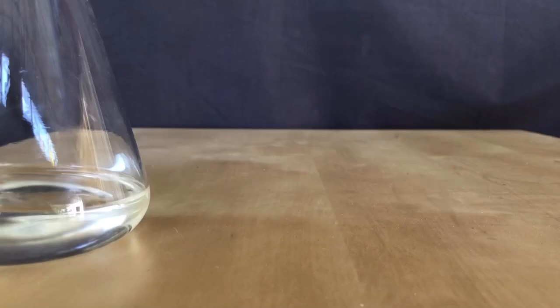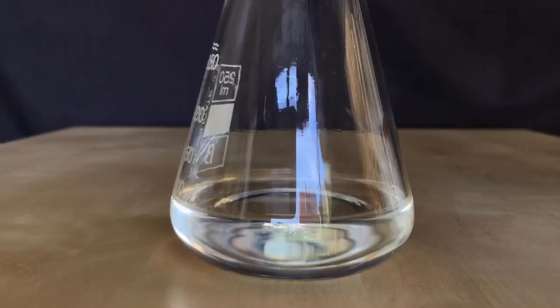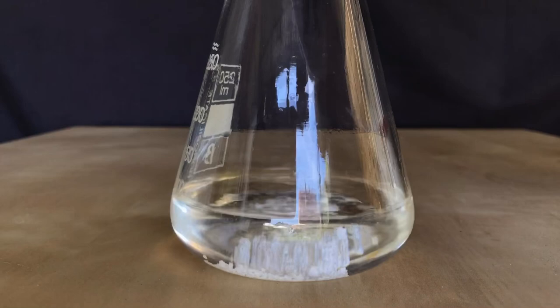The product might still contain water, which we need to eliminate. Anhydrous calcium chloride was chosen as a drying agent — about 3g of it were added to the ester and the flask was swirled around.